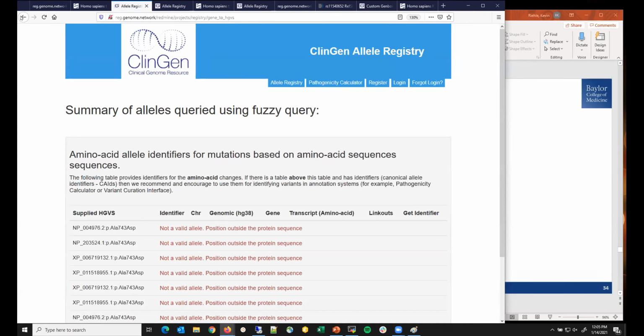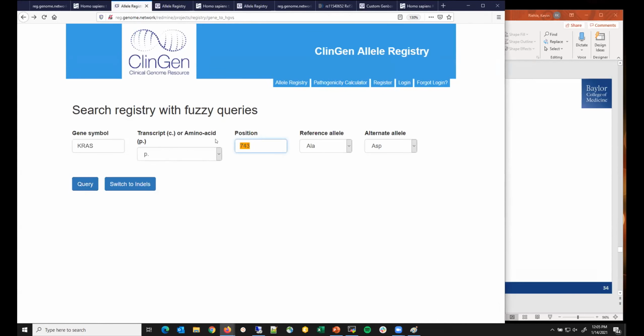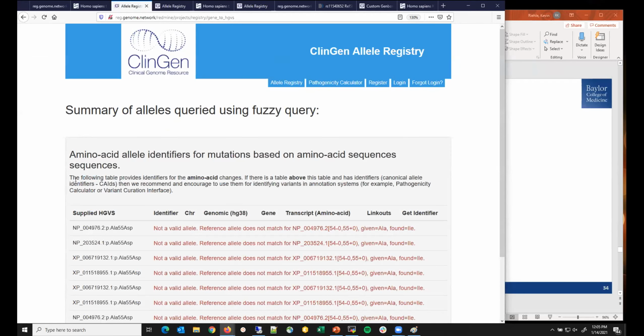I used the wrong sequence, but sometimes that'll help alert you to a problem. So that's a little bit of a sanity check. It's not perfect, you have a 1 in 4 chance of coincidentally finding the single nucleotide.